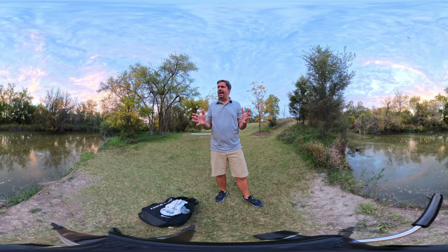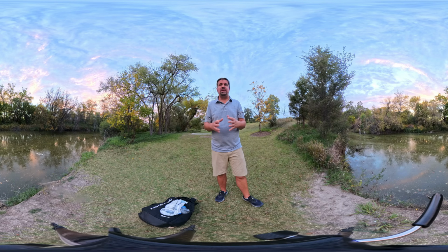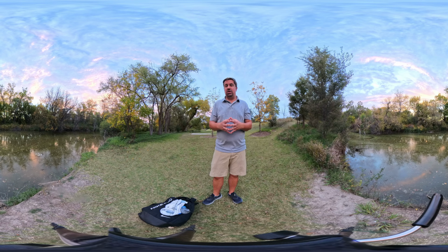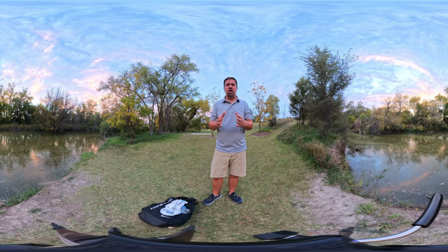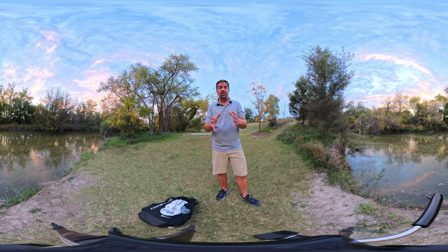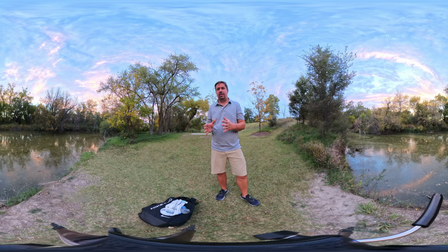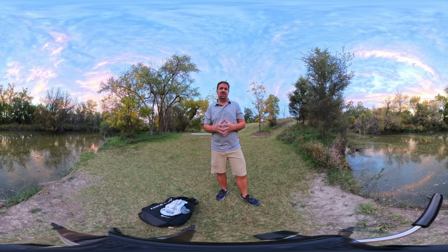So how do we find out if this really is a cyanobacterial bloom, or if some other, maybe photosynthetic, species is actually accumulating here on the water surface? And if it is a cyanobacterial bloom, what kind of cyanobacteria is predominant in the water? Those are the questions we would like to answer with the help of our course-based undergraduate research experience, our CURE. This CURE is the main objective of the second half of the course Bio 325L that I'm teaching this semester.